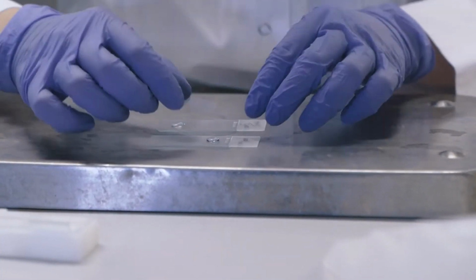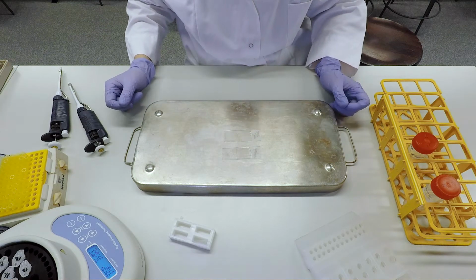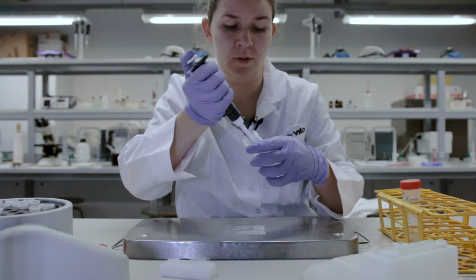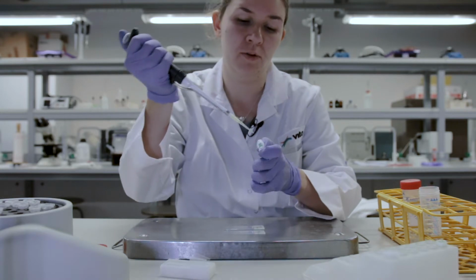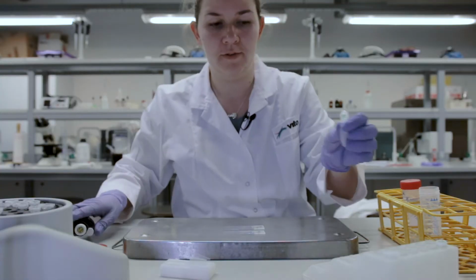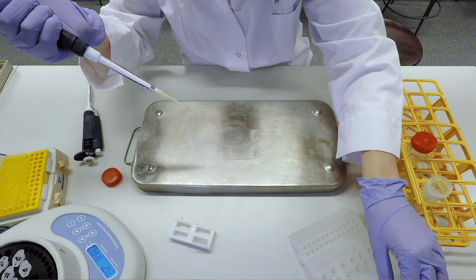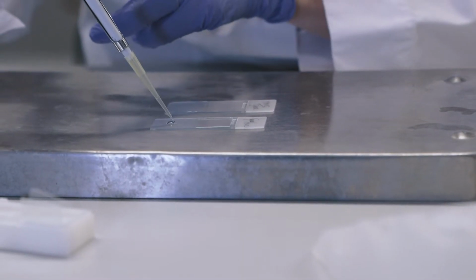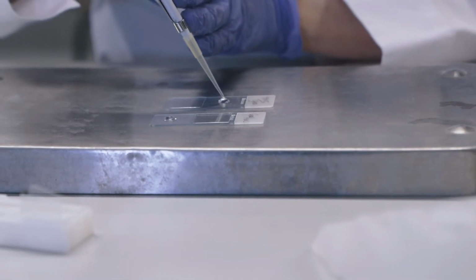And then you cover it with a small cover slip. Ideally these cover slips are 22 times 22 millimeters. Okay, so now we're also doing lymphocytes, or I should say leukocytes, because it's a mixture of lymphocytes and monocytes. 50 microliters. I'll mix it again with 1% low melting point agarose. And then we take 70 microliters for each of the small gels.